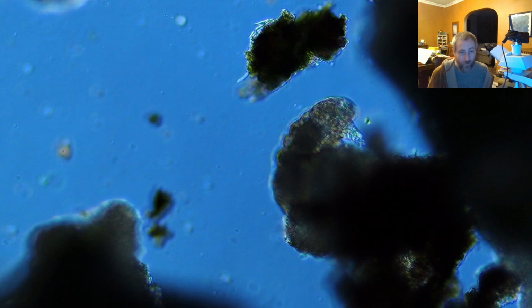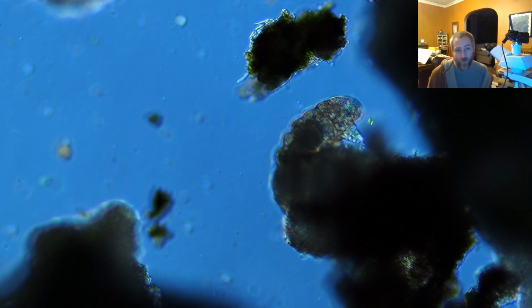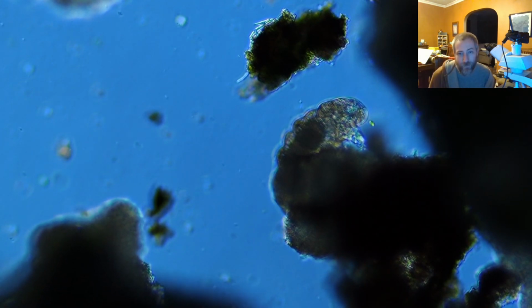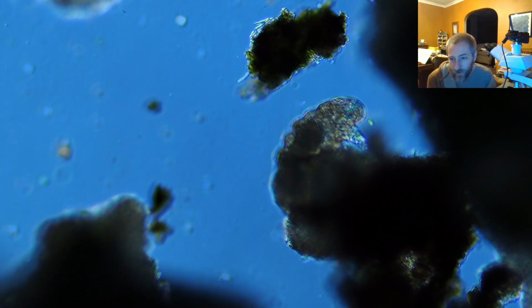However, if you find a water bear that can go into the cryptobiotic state, it's likely that it could handle being in really cold temperatures and really warm temperatures, and super acid conditions and very low pressure and very high pressure, because they test those organisms while they're in that state. So I think they probably could handle it. It's a question as to when they switch into the hibernating state versus the more active state.